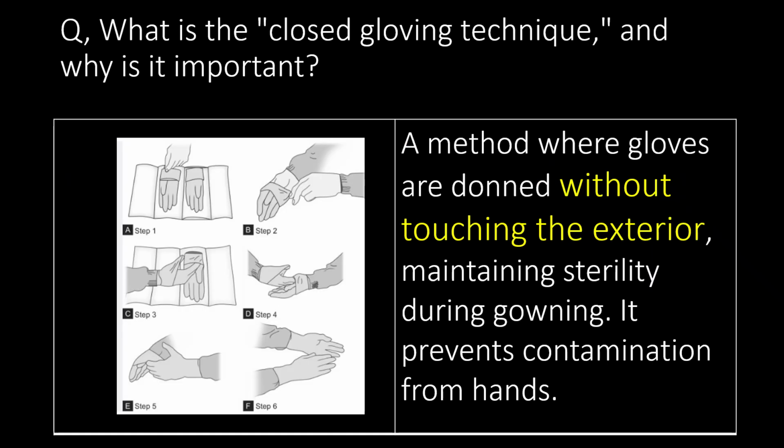Very frequently asked question: what is the closed gloving technique and why is it important? Closed gloving technique is a method where gloves are donned without touching the exterior, maintaining sterility during gowning. It prevents contamination from hands.